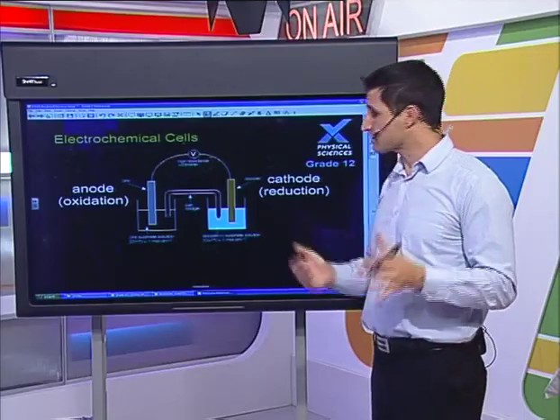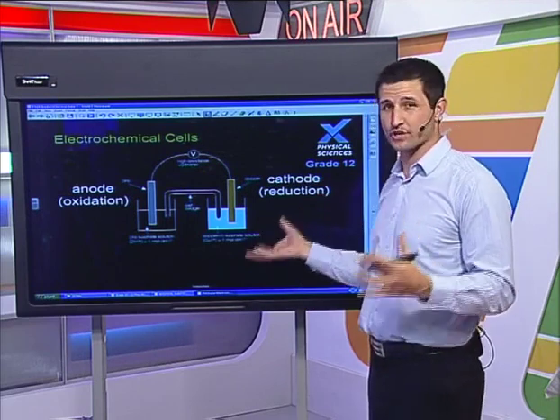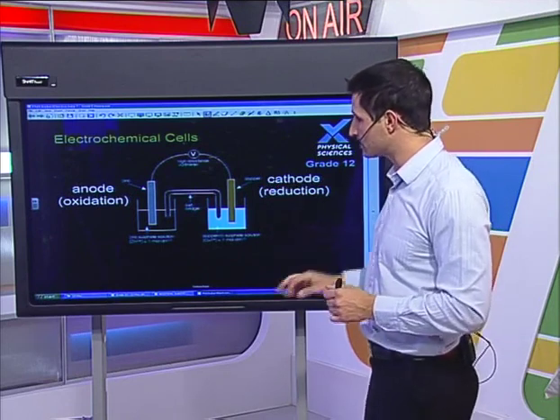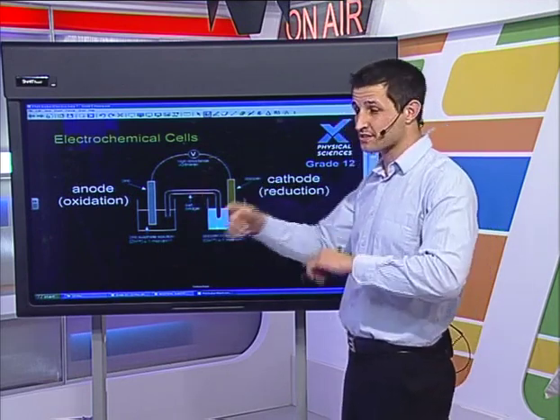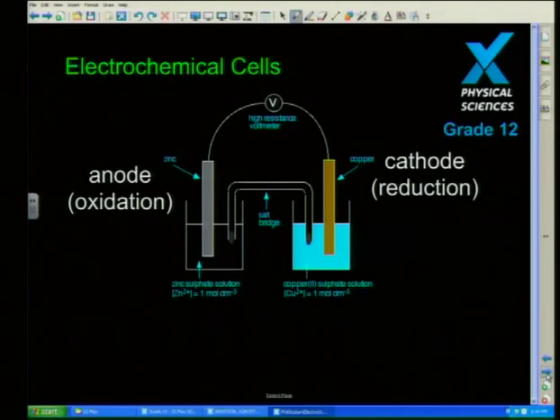Okay, well, it looks like we're doing quite well on our redox chemistry. We've been talking about electrochemical cells all the time. Now, I just want to show you another way in which they can actually do this. This is the exact same reaction, and Ty's actually posted this up on the page so you guys can see it. They've actually separated out the half reactions.